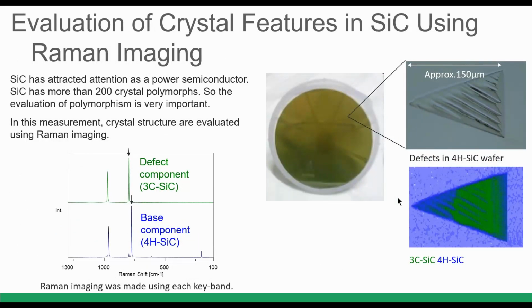In this application, we can see the silicon carbide wafer that is getting more and more popularity. And in this application, what we did is just to measure one contamination or one precipitate. And it's really interesting how in the Raman, and this is specifically for applications with high spectral resolution, we can see that the Raman spectra are very similar. They are very close. But when you have a very high resolution instrument is when you can see the difference between the two spectra and actually determine that that precipitate that you see there is just a defect in the silicon wafer.